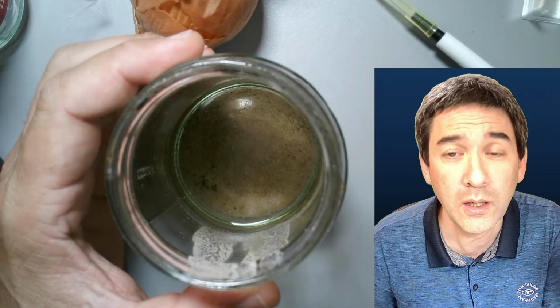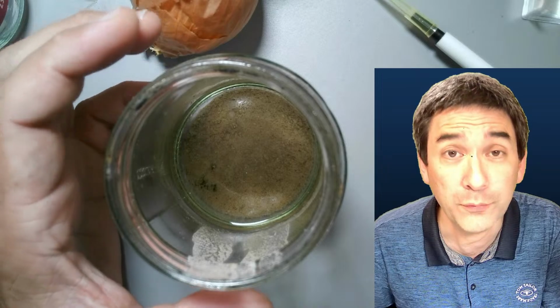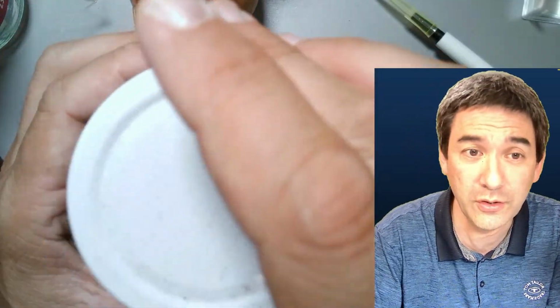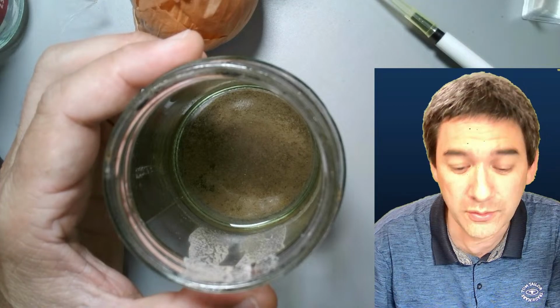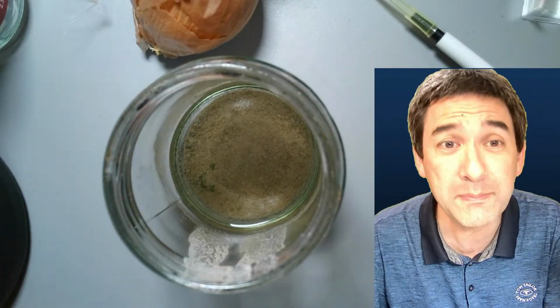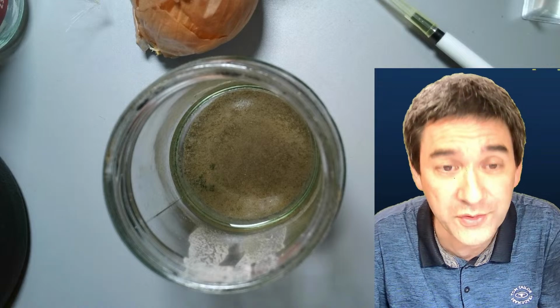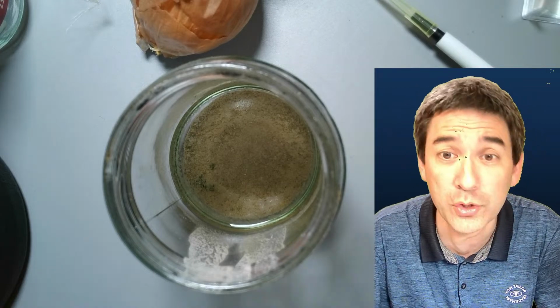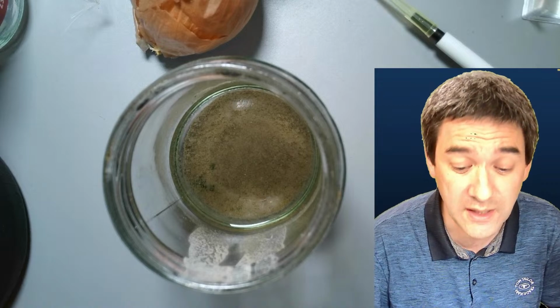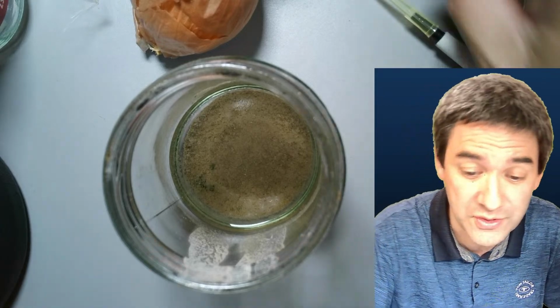There were a lot of diatoms in here and a lot of movement. It's been standing here now with a little lid covering it, so that there is not too much evaporation, for two years. I do not expect any living things anymore. A few months ago I did check it, and there was not so much movement. But I would like to check it again and see what we're able to see here.